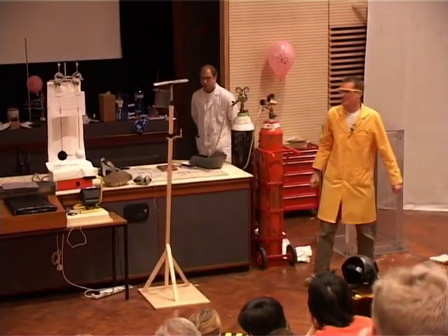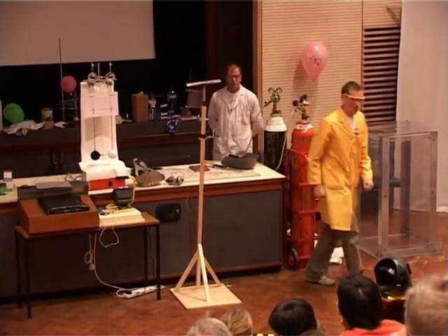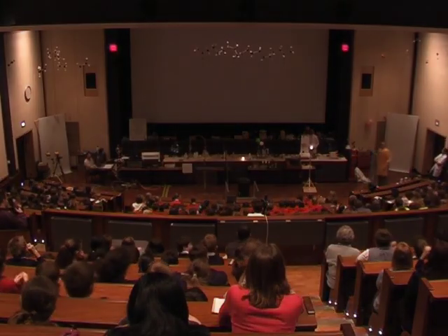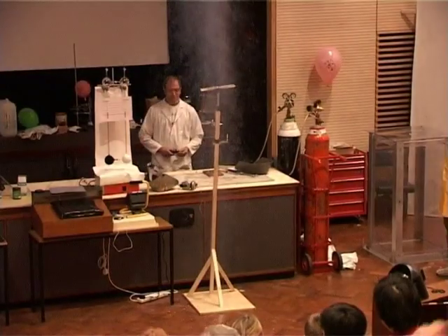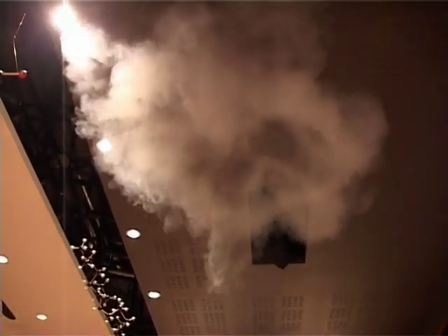This is exactly the same sort of thing that early photographers used to do. They used to hold this themselves. Well, I'm not going to hold it. I'm going to step back here. Okay, so we'll have a countdown again. 3, 2, 1. There we are. There's a rather nice smoke ring just forming at the top.